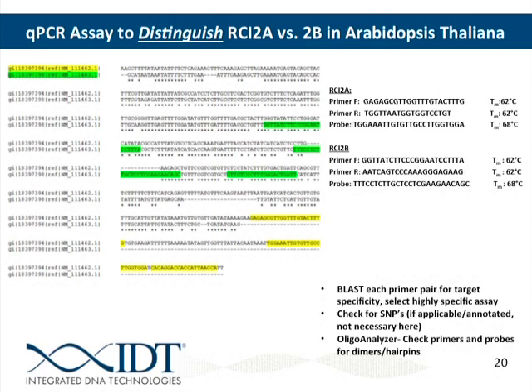I have a question on that previous slide, on that probe, on the first one, isn't that probe overlapping a little bit on these? Right here. Right. Yep. But would you want to just not have that part of the probe when you order it? No, you can order it as is. Likely when that probe tries to lay down, it doesn't have very much similarity on either end. It's not going to be able to lay down.